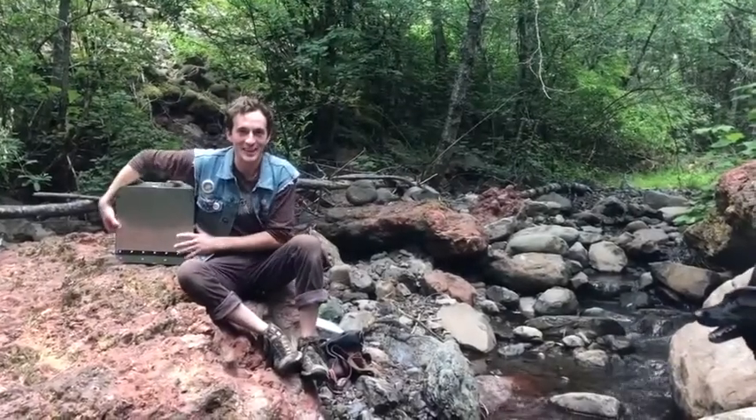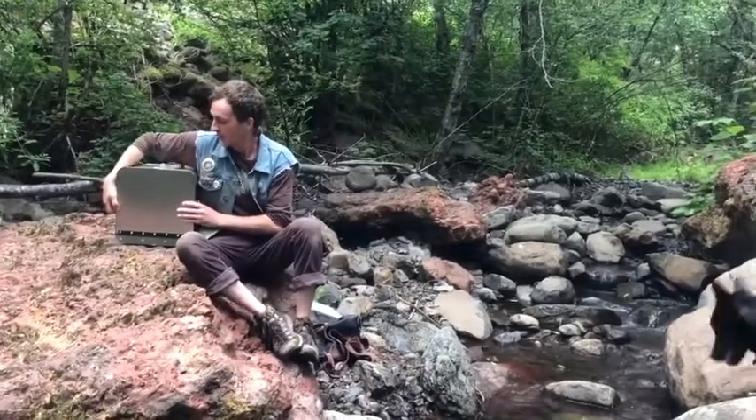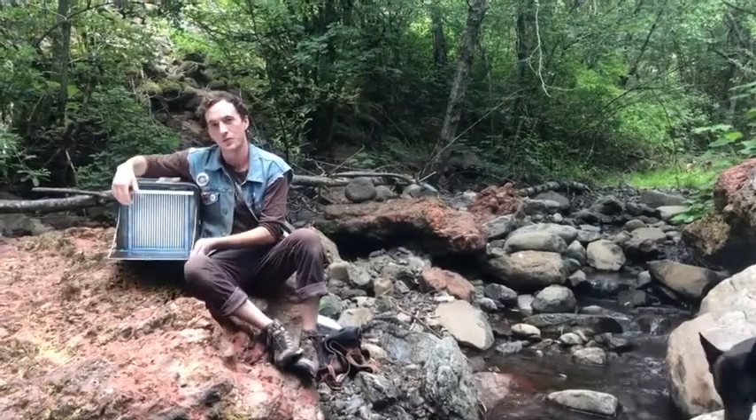Hi folks, thanks for joining me today. I'm really excited to tell you about something I've been working on for the past year or so. This is the first prototype of what I believe to be the world's first portable battery-powered laminar flow hood.